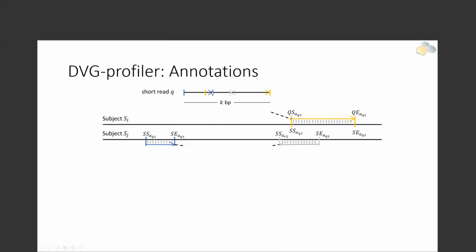But in the case of a junction or other events, you'll end up with some reads that have a subsection aligning somewhere in the reference sequence, then another subsection probably aligning in a reverse direction, and then maybe a third one overlapping or non-overlapping the other two somewhere else.